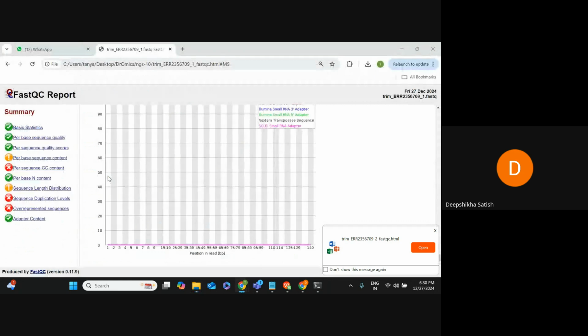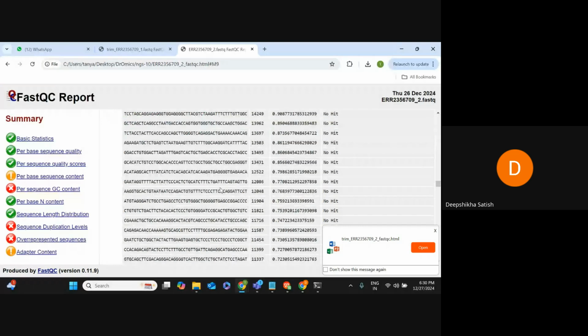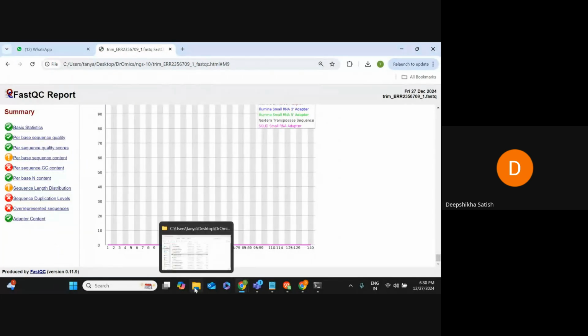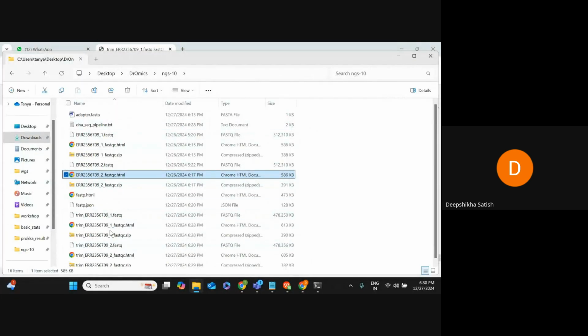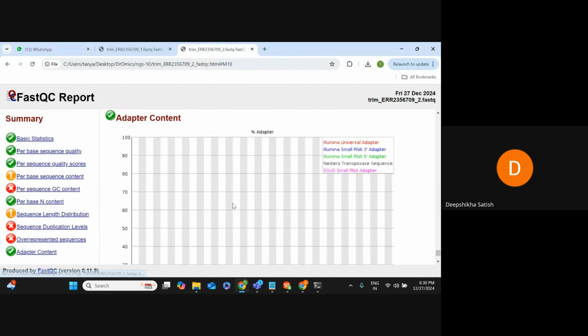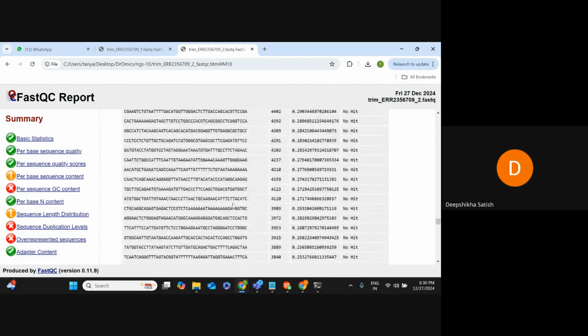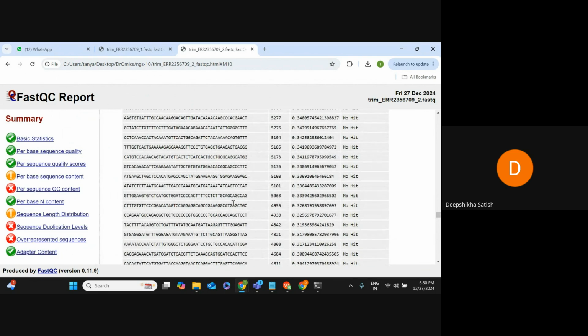So this is how we trim the adapter sequence, guys. This is not the file. Yeah. Adapter content, no, and then there is no hit. Can you see? Did you get this step? Trimming? Yes, ma'am. Okay, perfect.